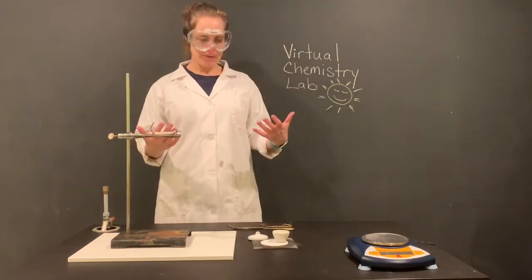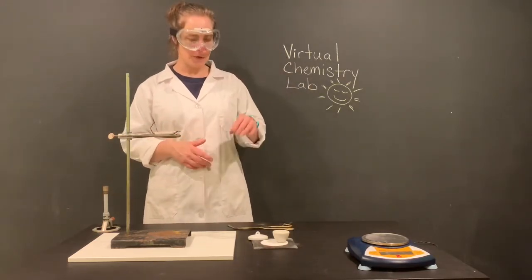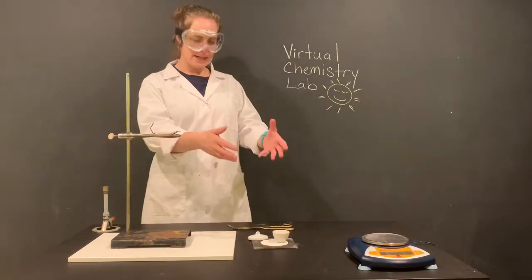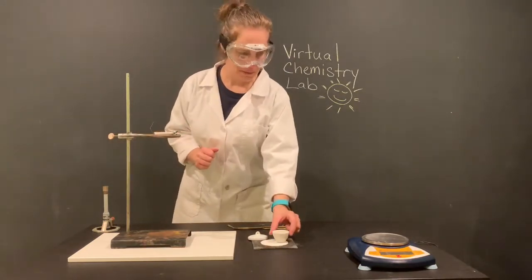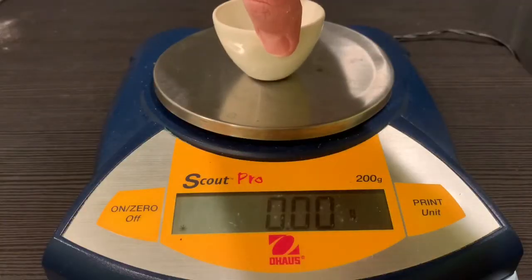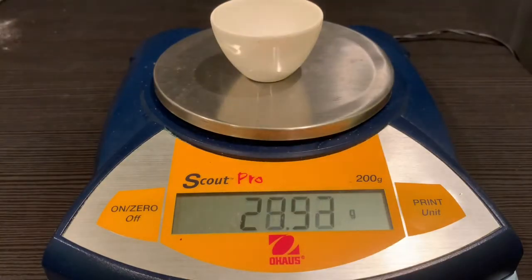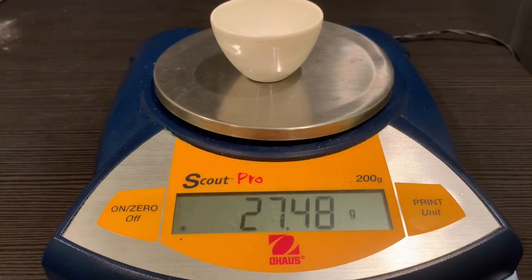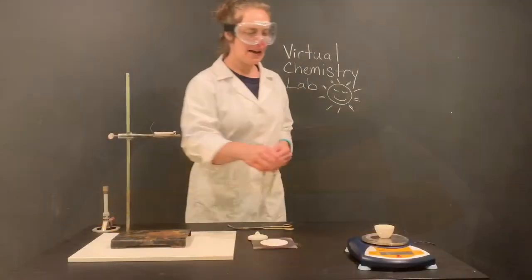So what we're going to do first is we are going to go ahead and take the mass of our empty crucible. So as I come in here to grab this, I'll take a moment and you'll record that mass. Now when you record the mass, make sure you're recording all the digits.